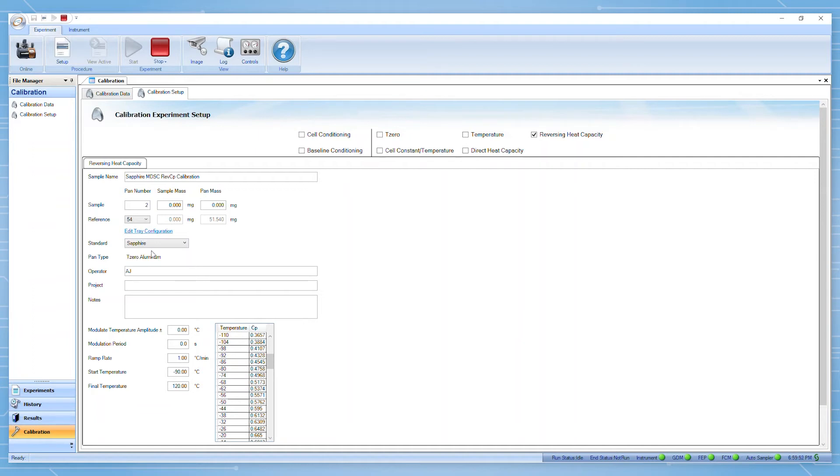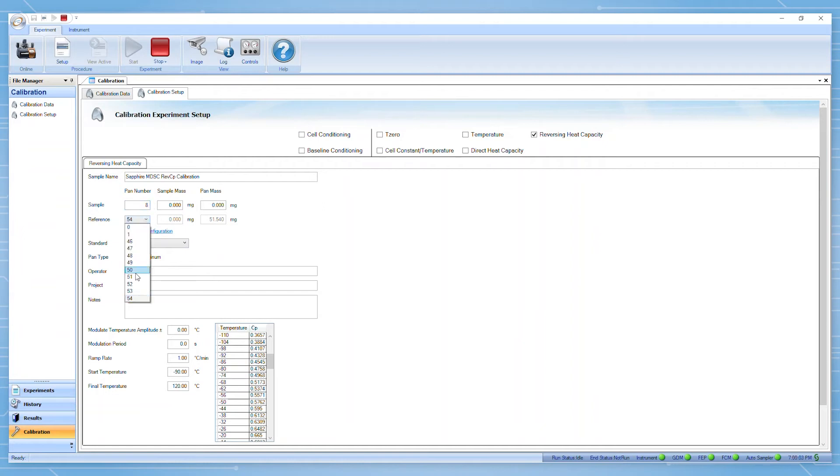If you are using an auto sampler, you can input here the location of your sample pan and reference pan. Again, you must match the pan type of your reference pan to the one you're using for your sample.